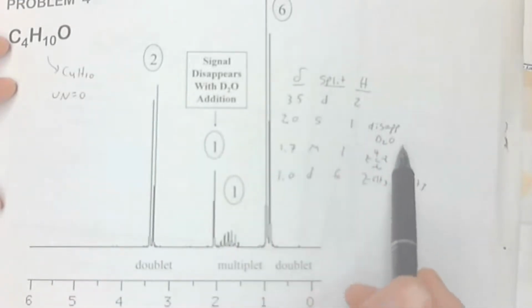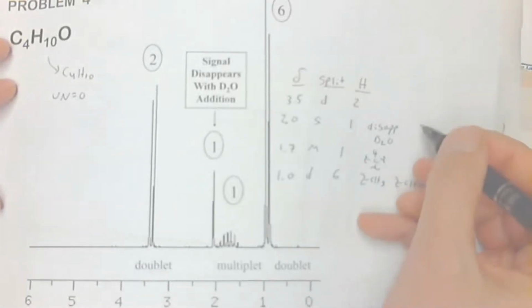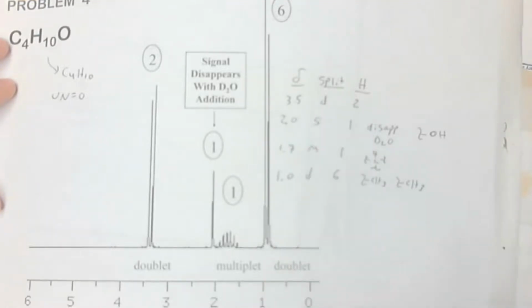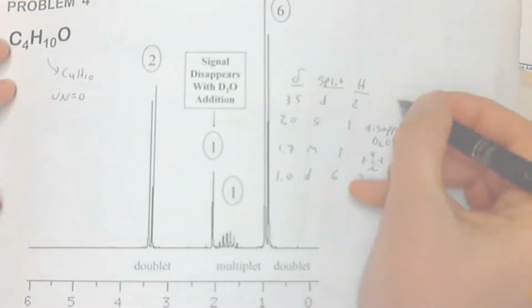Probably an alcohol, yeah. Somebody said alcohol. And how do I draw a substructure for an alcohol? And how many squigglies are on that substructure? Well, it's just this. That 1 squiggly, right? An alcohol has 1 squiggly, right? What do you think this is? 2. What's your best guess? I see CH2. I see CH, I see CH2. It's definitely CH2, yeah.